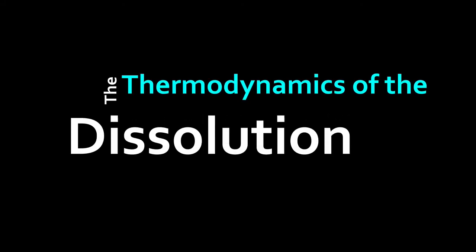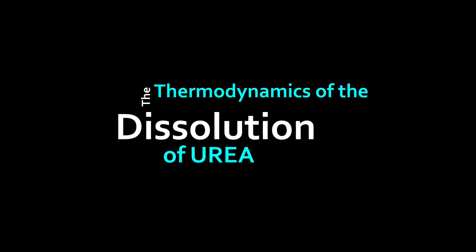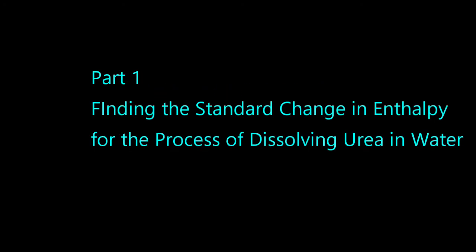This lab is on the thermodynamics of the dissolution of urea. In part 1, we find the standard change in enthalpy for the process of dissolving urea in water.